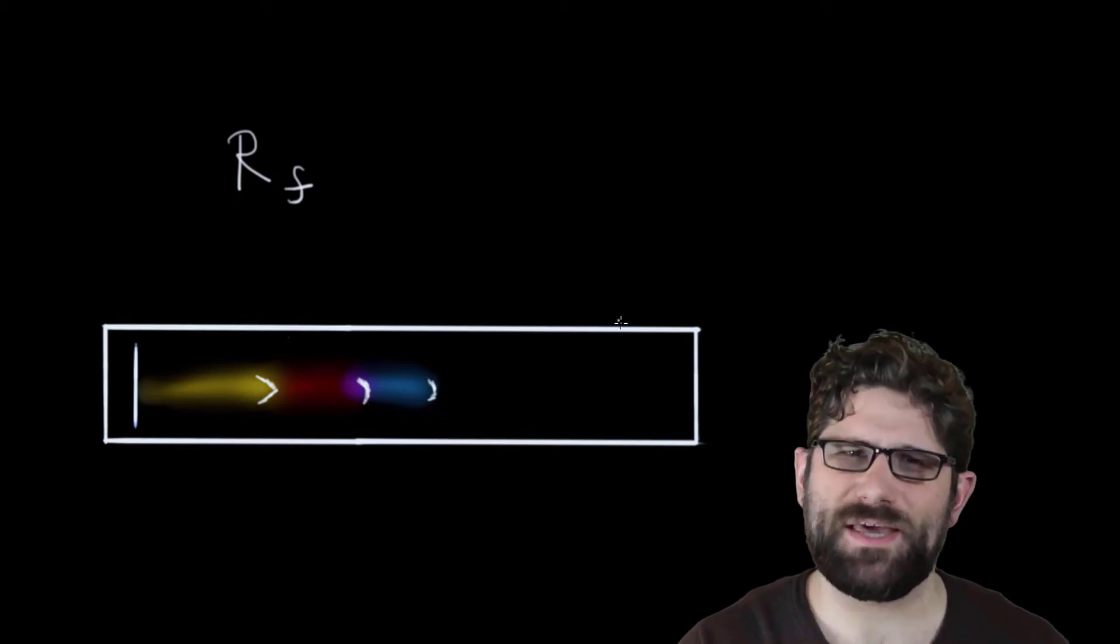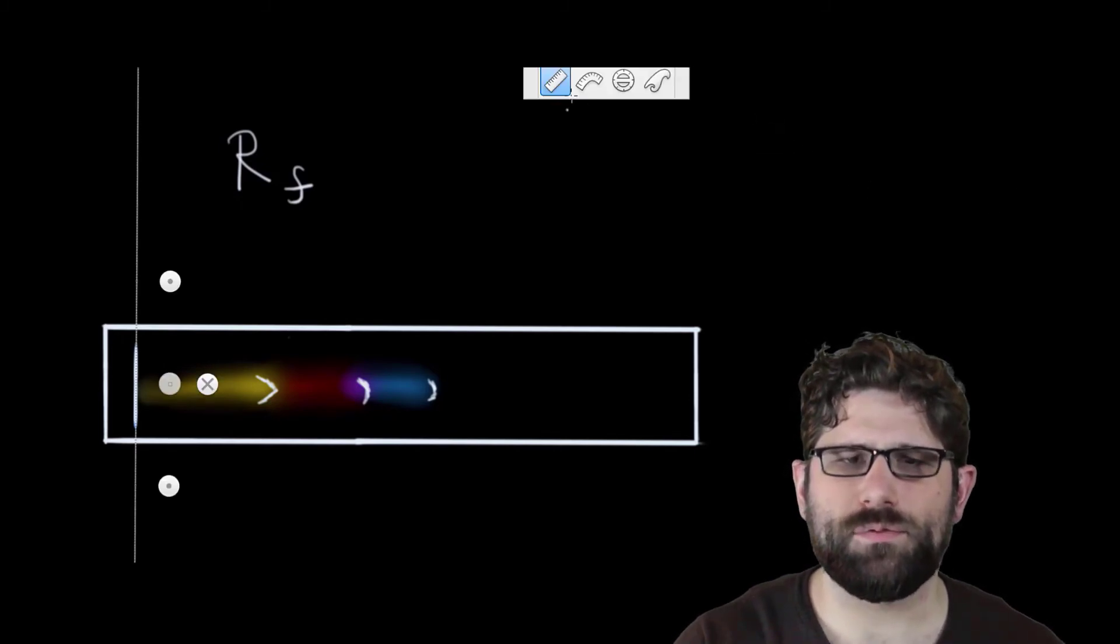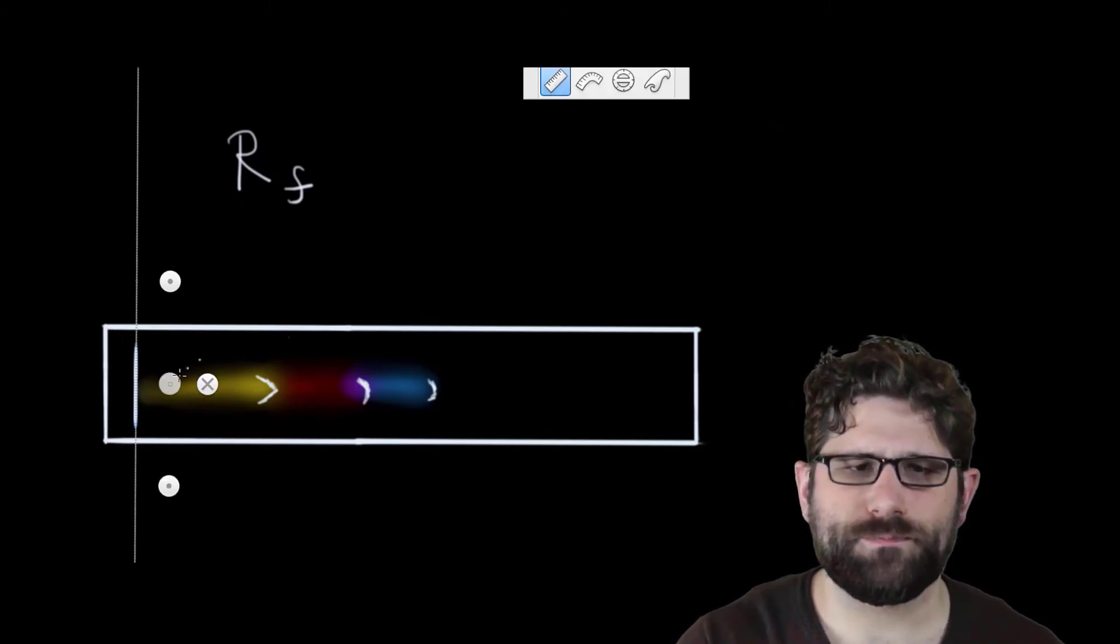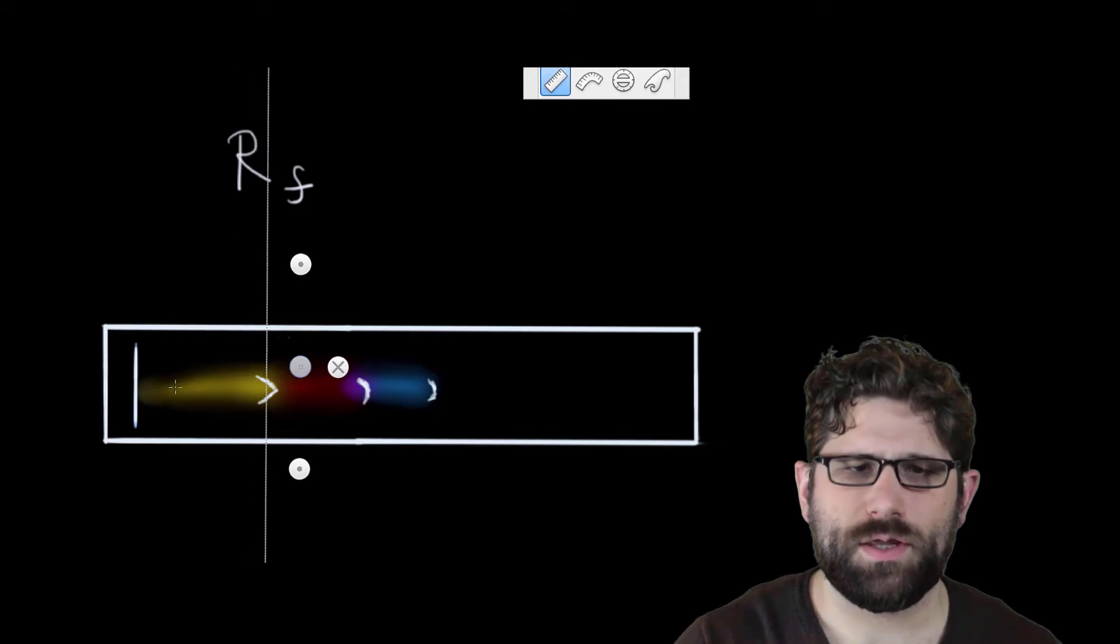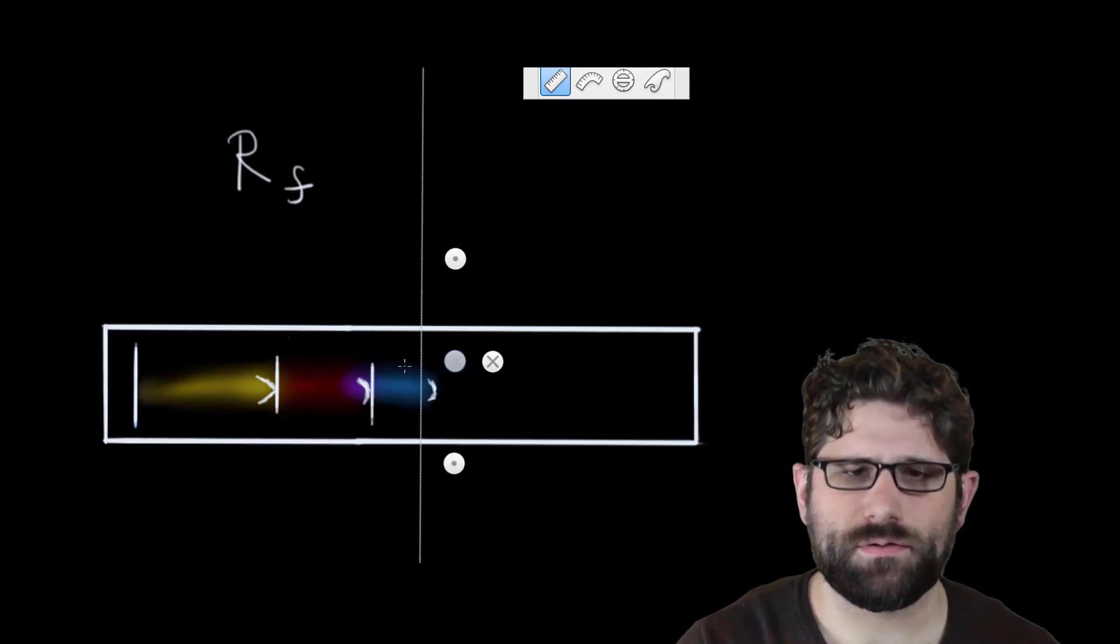So there's my three pigments. I really only have those three, so I'm going to mark those clearly with a little straight edge. I'll draw a line across for each pigment.